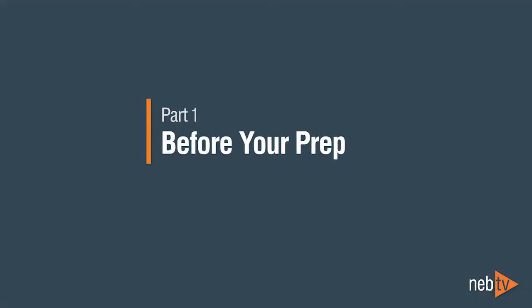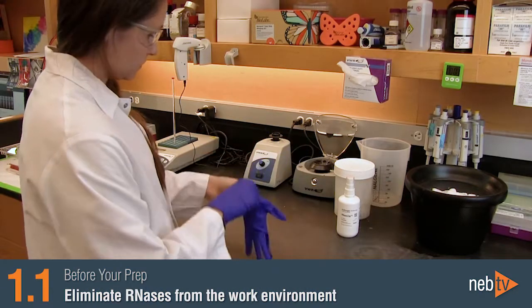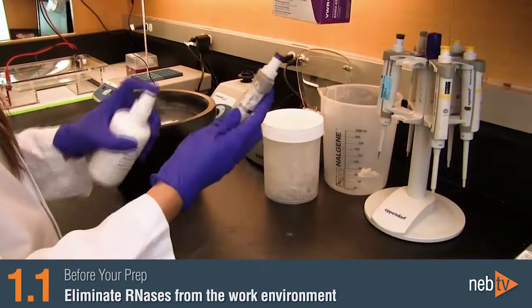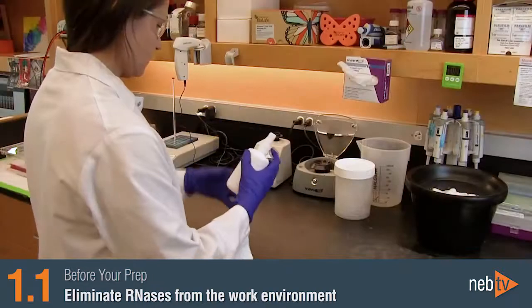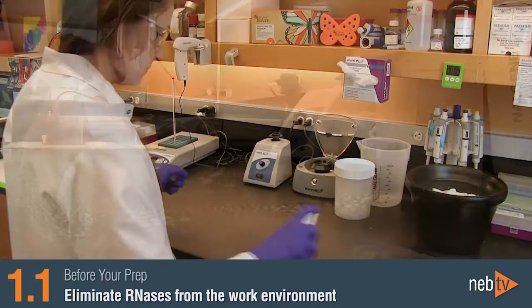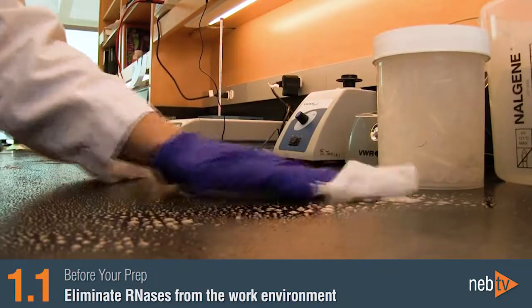Before your prep, it is important to work in an environment free from RNases. Always wear gloves, use RNase-free glass and plasticware, and clean your work areas. We recommend wiping your benchtop with a cleaning agent such as RNase ZAP.